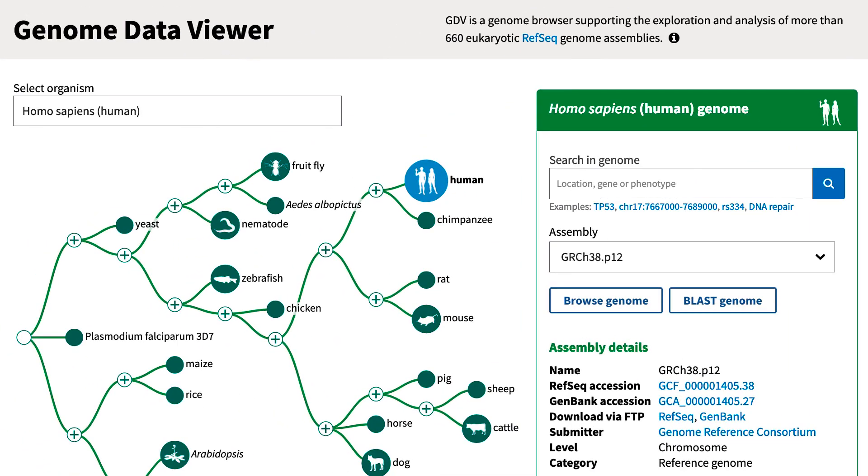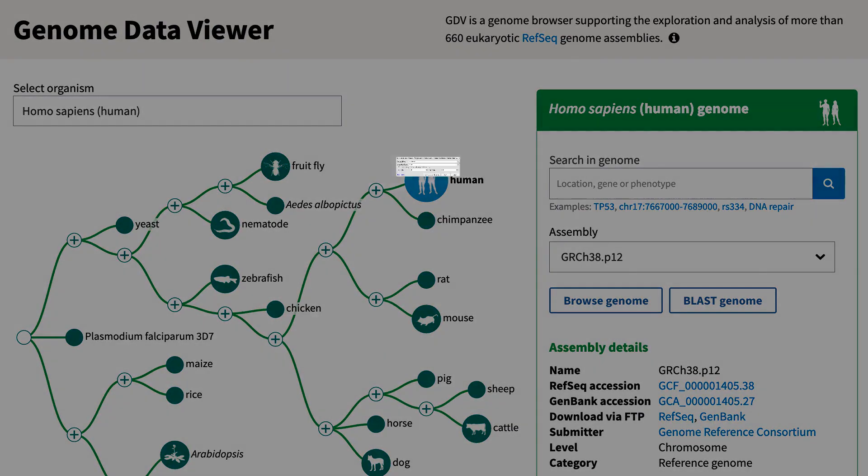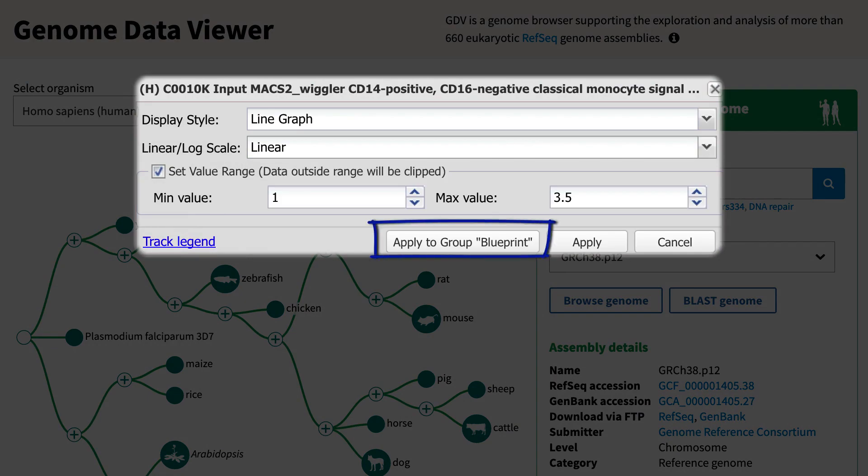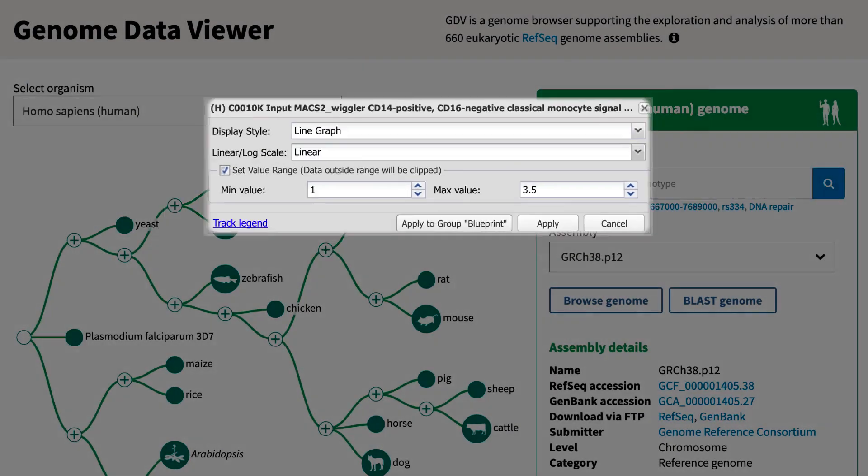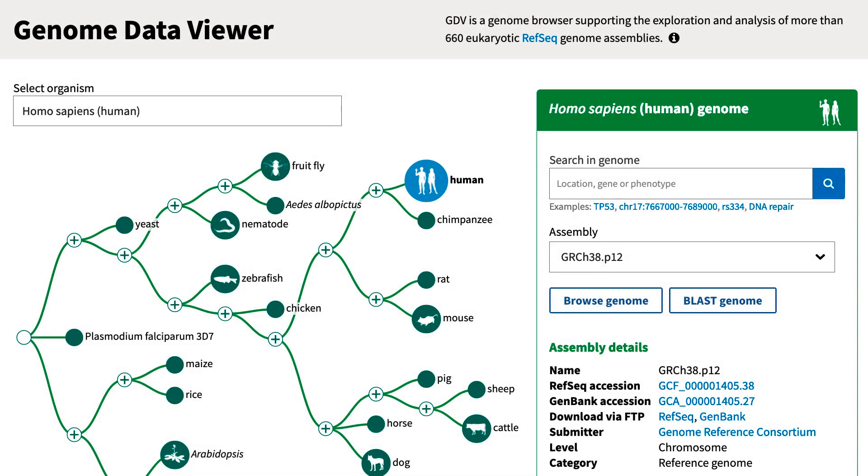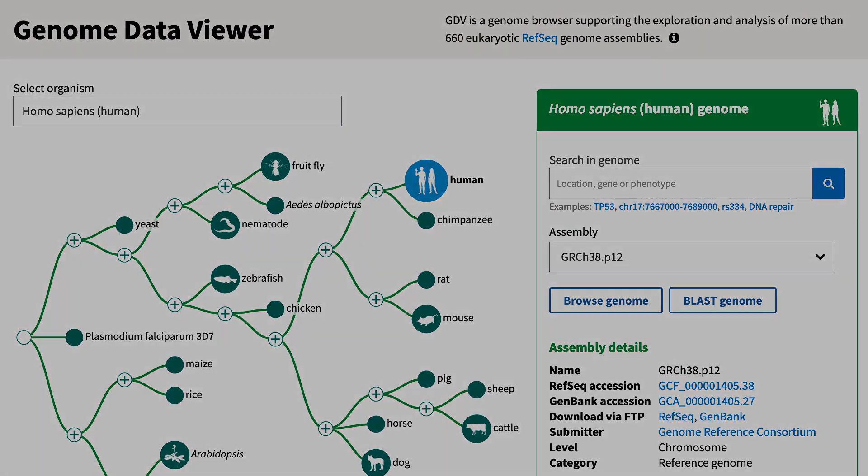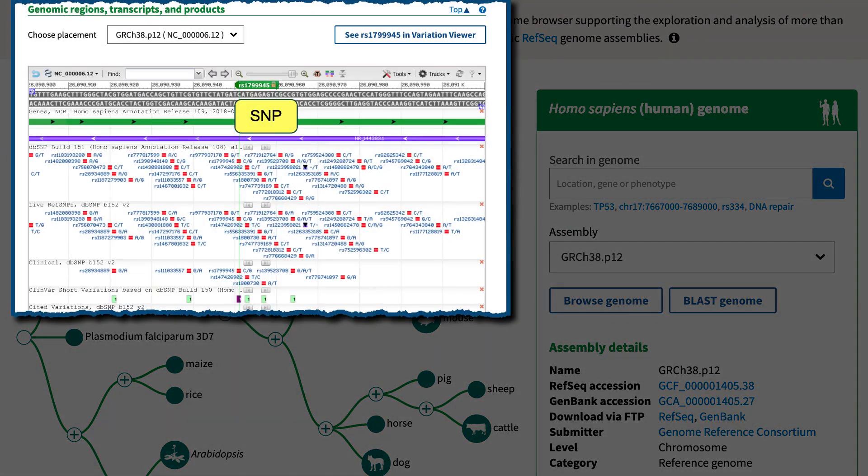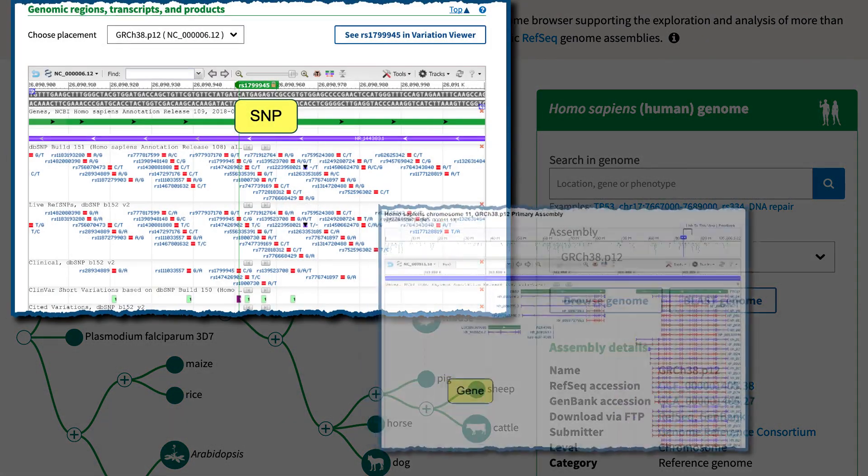This is a quick demonstration of recent enhancements in our Genome Data Viewer, including several track graph settings and the ability to apply settings to all tracks in a composite track hub. Even though today's examples use the Genome Data Viewer, these enhancements also apply to other NCBI resources that incorporate the Sequence Viewer, such as SNP and Gene.